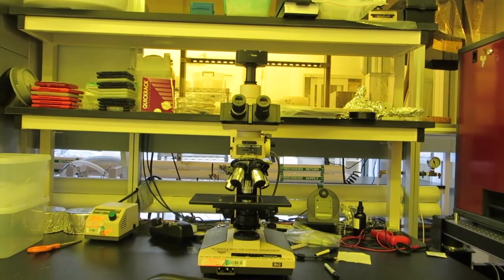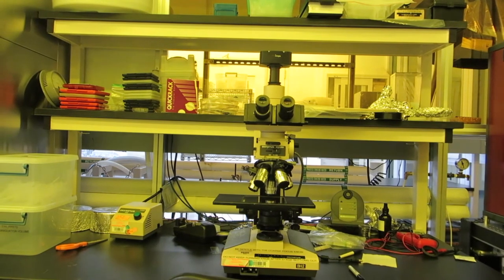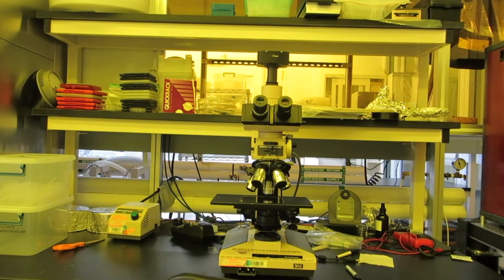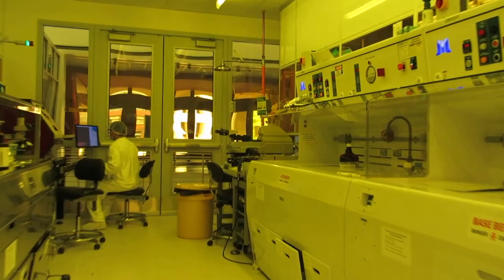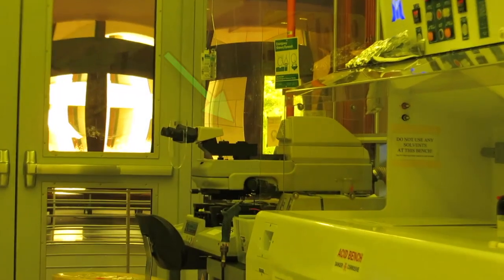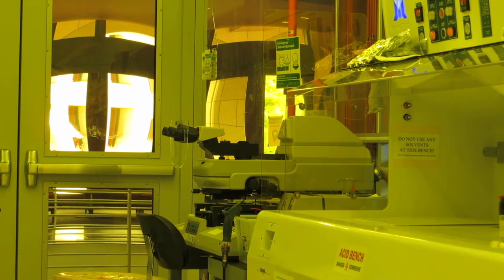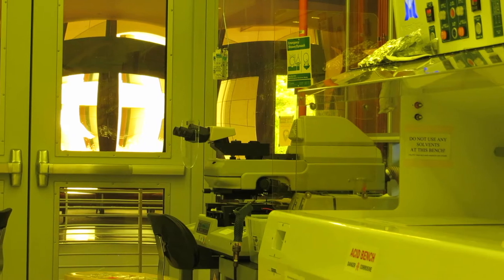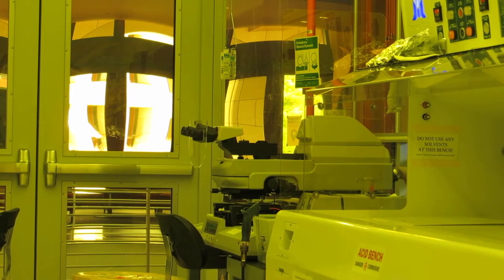On the bench to the left of it is the Olympus microscope. This microscope has a yellow filter for the light source so that you can look at resist features without exposing the resist. Across the aisle from the ML3 is the Quintel mask aligner. Normally you will need a glass or quartz mask to use this. However some people working with SU-8 use this using homemade laser written transparency masks.